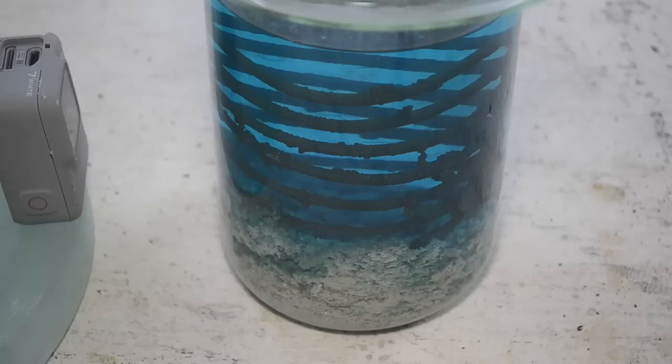That's a lot of silver for only 1/2 hour. I know there's more in solution yet. Just, as the concentration goes down, it just takes longer to cement out. So, gonna let it go.